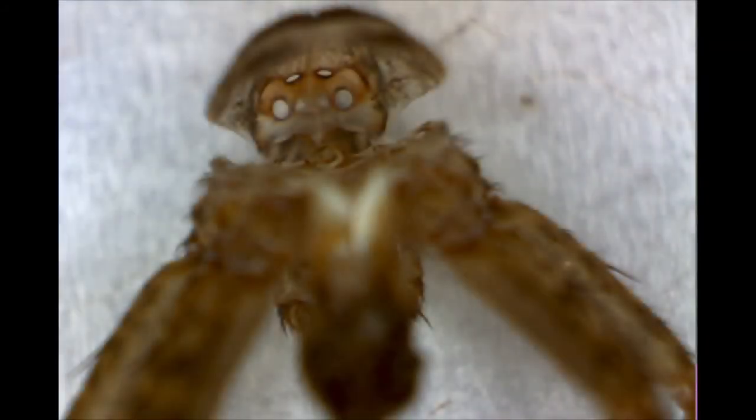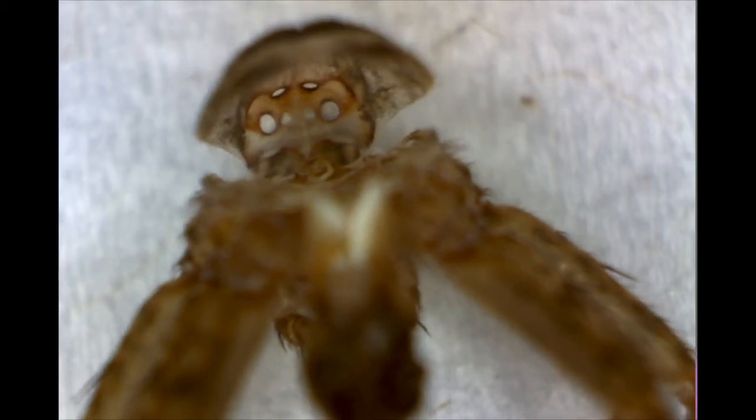The slightest amount of wind — my breath, for example — just blows it all over. I've managed to finally get into a good orientation. This is the back part, so his face is away from us. We'll look at the back of his head and the back of his eyes — those four eyes we've seen from the front, and those two little dots up the top. I'm pretty sure they're another set of eyes. Maybe they're his head noses? I don't know. That's how he came out — from the back.